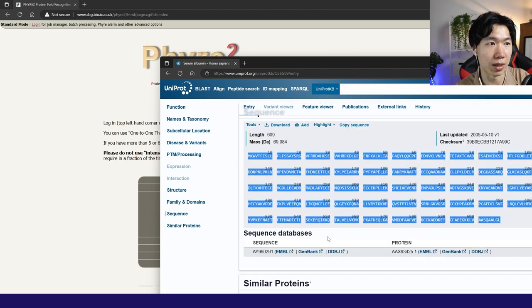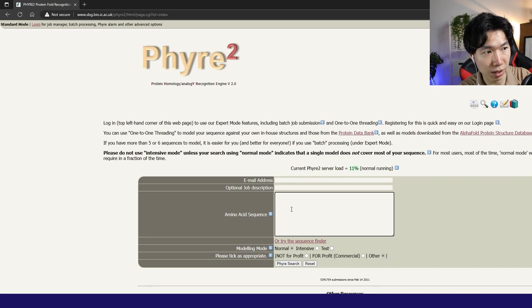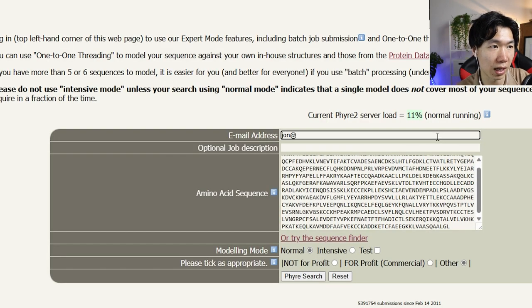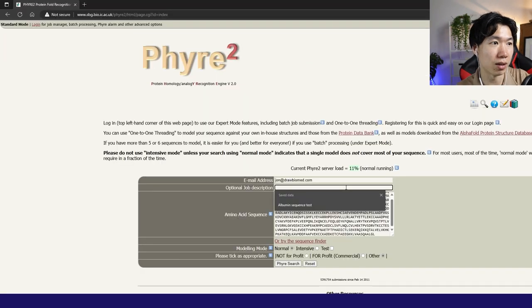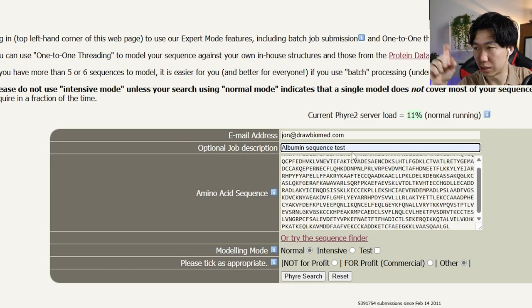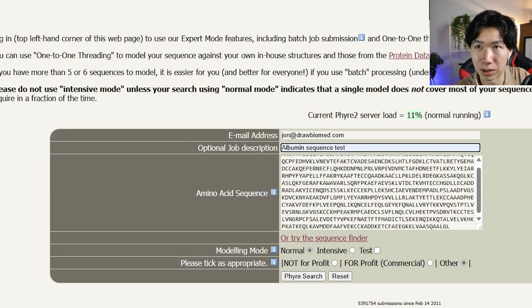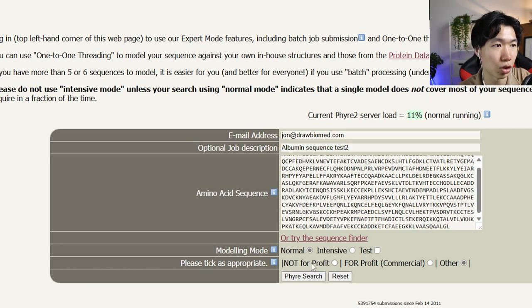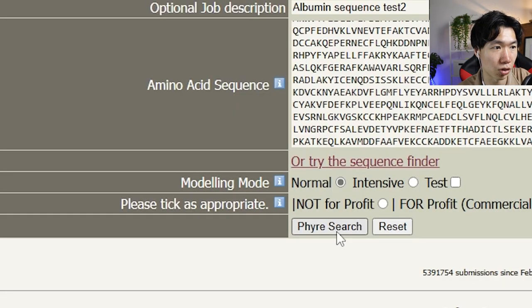I'll just copy it and paste it here in the amino acid sequence box and type in your email address and you can add in the job description that will be the title of the email that you get. You also need to choose if you're for-profit or not-for-profit. Phyre2 search.